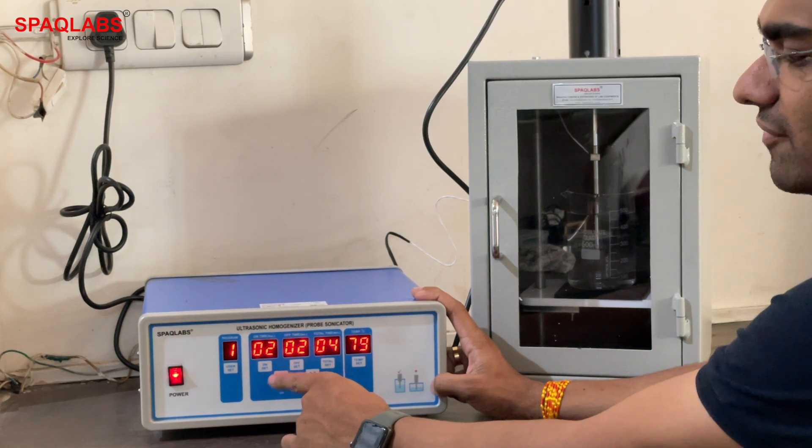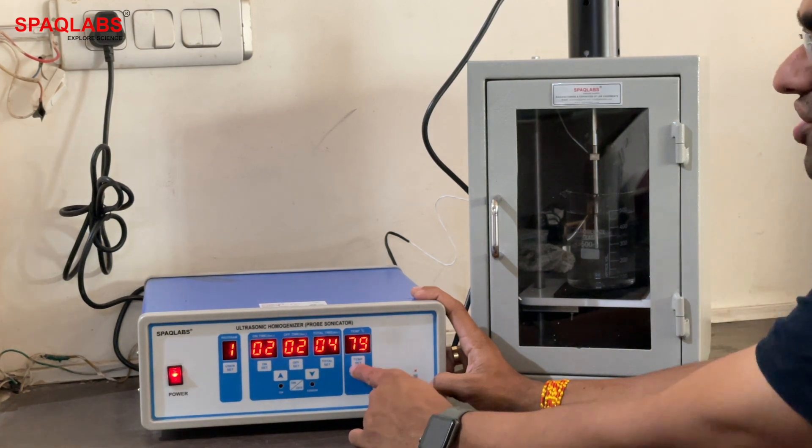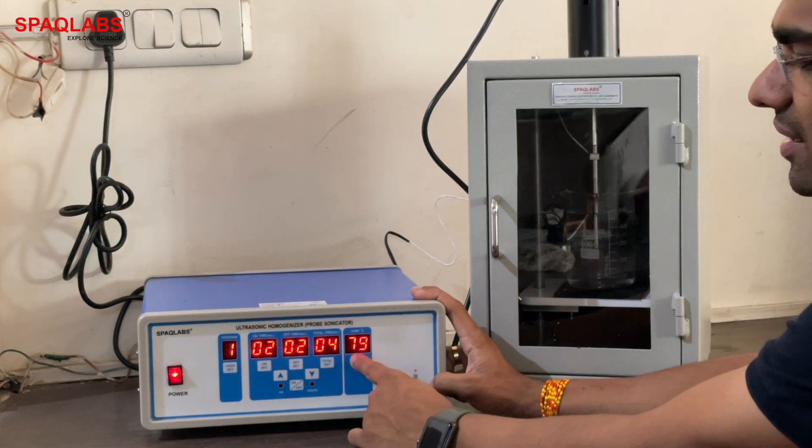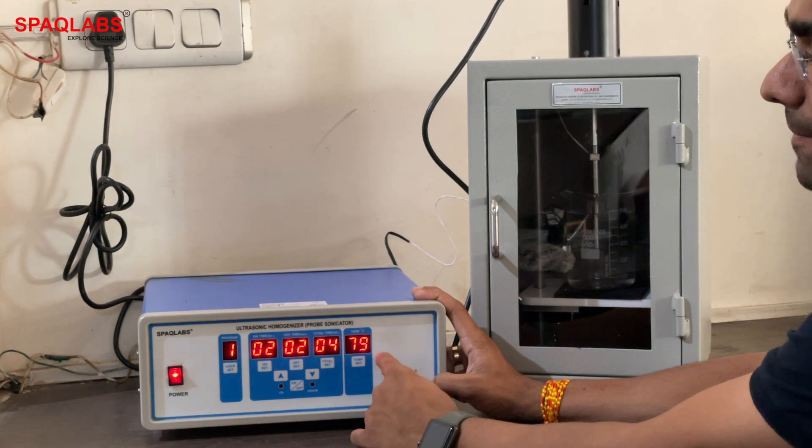How long will it run? Four minutes total. Set temperature is like a maximum temperature offset — when the sample reaches the maximum set temperature, the sonicator will pause.